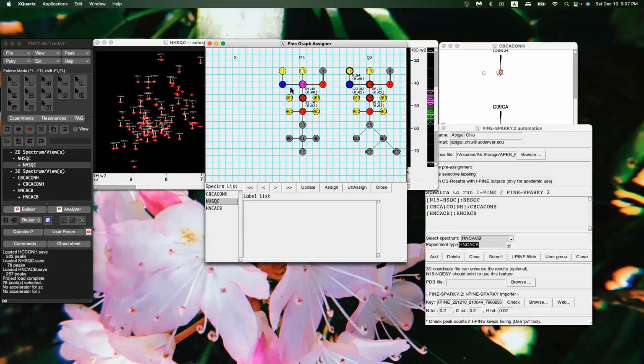For the first residue, however, it might not be assigned. It's not going to be assigned because there's no I-1 residue before it. And remember, when you're assigning each residue, it uses the I-1 in order to find I. Does that make sense? So for the second residue, this was found because there's an I-1 to be used to find it.